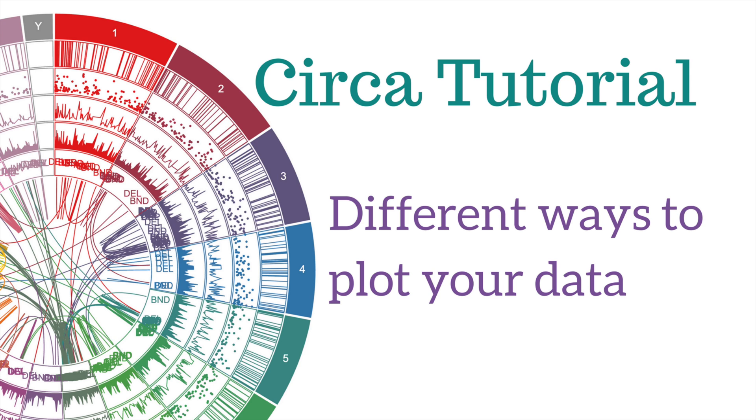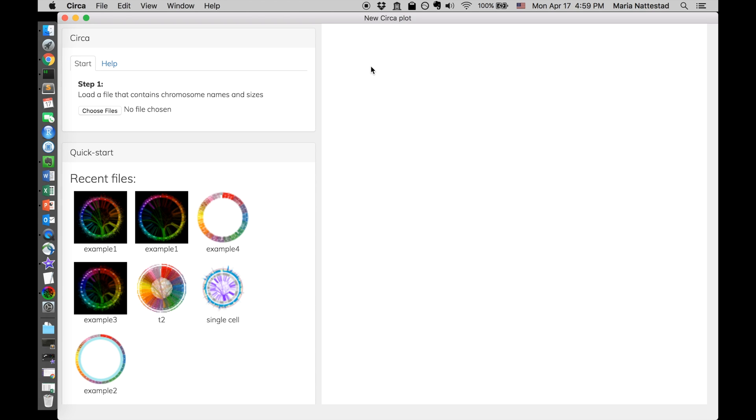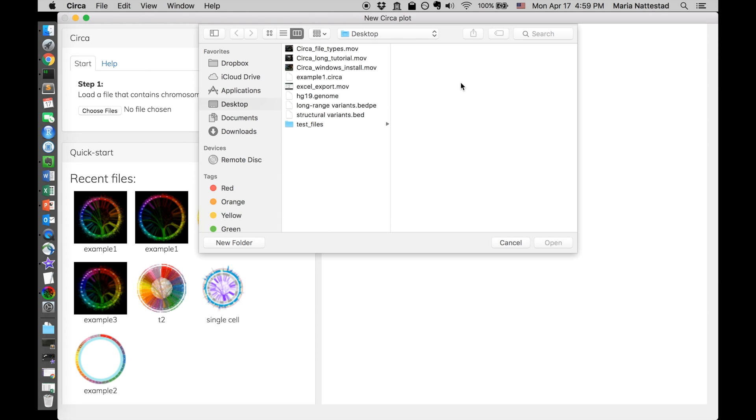This is an introduction to the many ways of plotting your data in Circa. We're going to create a beautiful Circos plot that shows one of every plot type.